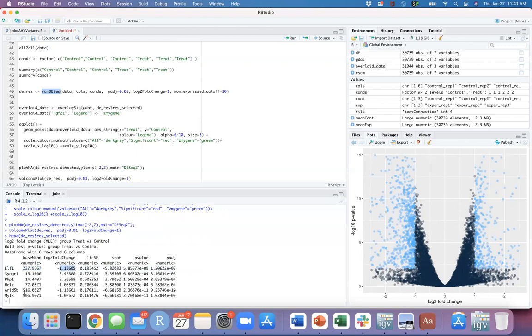It's using another function and adding some pseudo counts, because when you come down in the list, for example, if you have 0 counts in one case, it's just adding a count there before dividing, and it estimates the log2 fold change for low counts too. It's working more or less, but you believe these counts more when the values are higher.